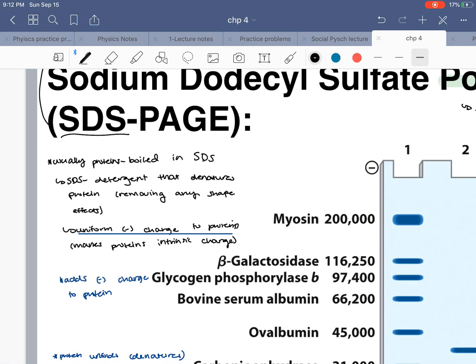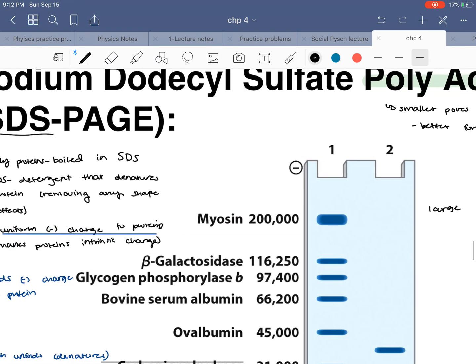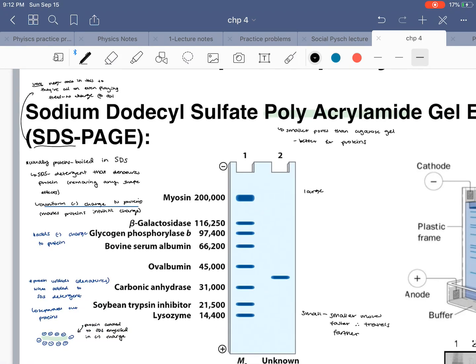And then the next step is that we want to boil it in SDS. So SDS is an extremely negatively charged species, and so by putting all of the protein into the SDS, we're making it so that we kind of level out the playing field, so that we're not looking at charge at all. We don't want to be sorting out the different proteins based on charge. We're only trying to sort them out by size. So by putting a very negative, uniform charge, we make sure that we're not actually sorting anything out via charge, which is desirable for this.